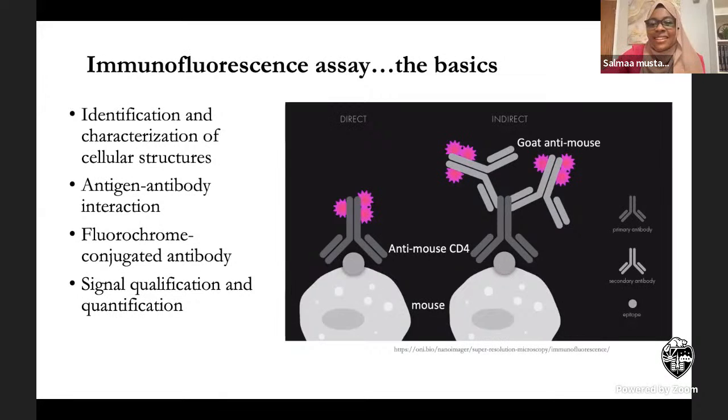We also have to remember that if I'm using, let's say, an Olympus fluorescent microscope, I have to be sure of the filters that I have, like FITC, TRITC, DAPI, all these colors. It's important before I order the antibodies. Yes, you have to know, like you said.